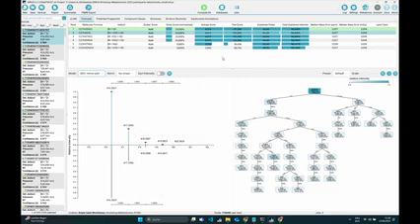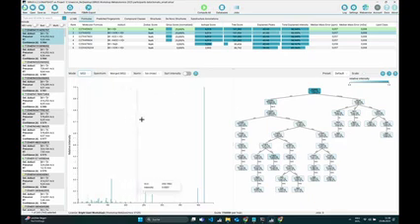The second thing that will be scored is the fragmentation tree itself, which you can see here. And if we now go back to the MS2 spectrum, what we can actually look at is now the different peaks and the subformulas with which they are annotated. So if you hover over this formula, unfortunately it's a little bit small, but maybe if you try it on your own screen, you will see that in this hover window right next to my cursor, there will be the formula highlighted and also some other stuff.